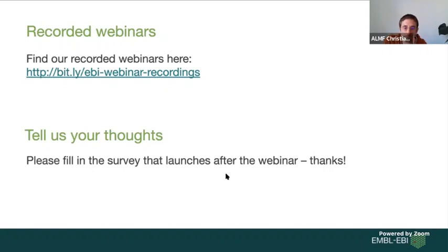Okay. There's someone with two. I lost connection, so I don't know if you already talked about it, but what do you think about using ImageJ? It's good. ImageJ is like always what I would start with, so no, definitely.